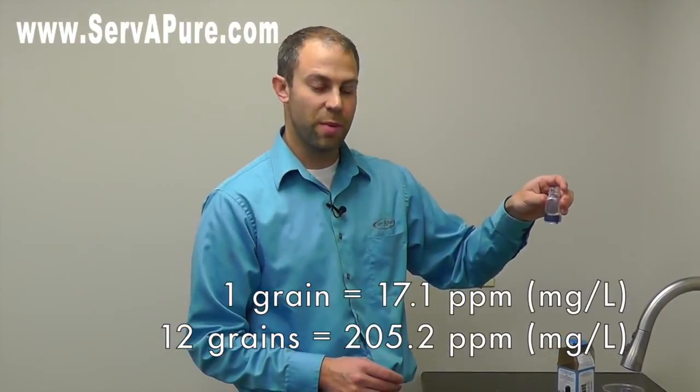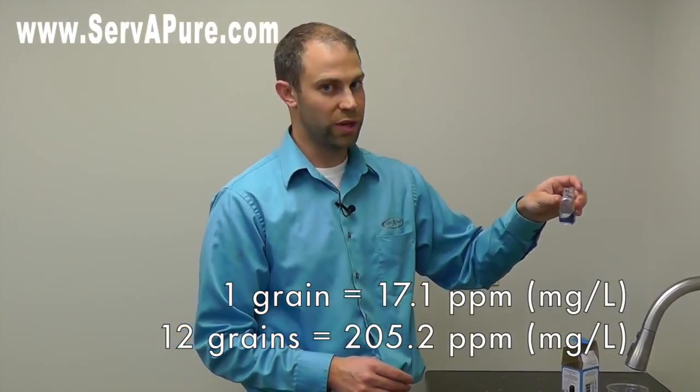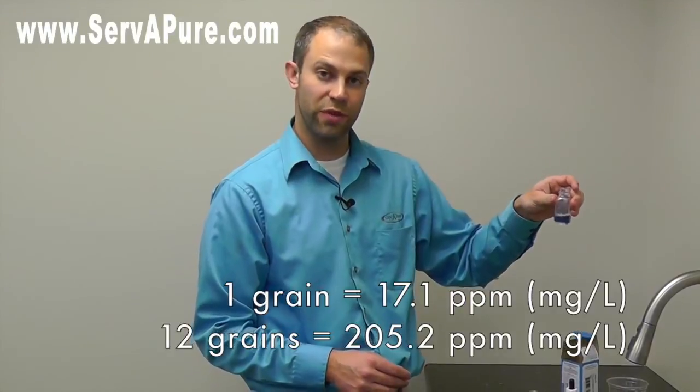If you want to convert that into parts per million, you multiply it by 17.1. So 12 times 17.1 in this case will give you how many parts per million. And you can get this hardness test kit at servapure.com.